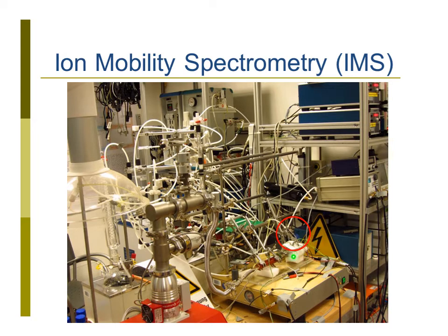And the ion mobility spectrometer is this small device here. And this is like an electronic nose. So gas goes in, is ionized. And then you send these ions on your journey, measure the time, how long do they fly, a certain distance.